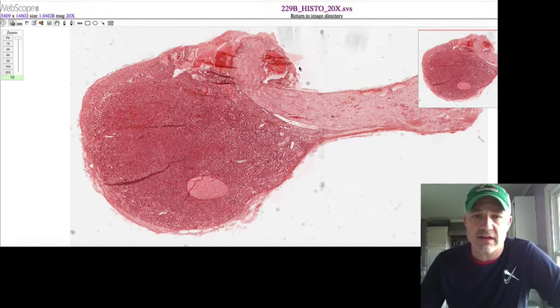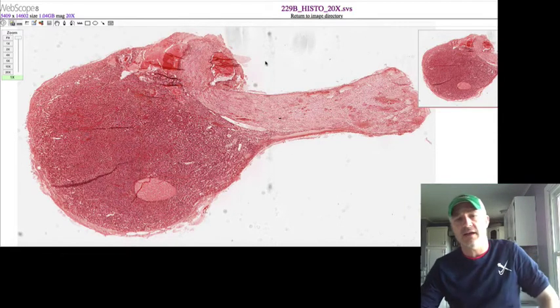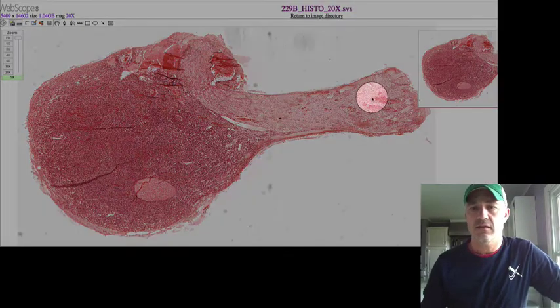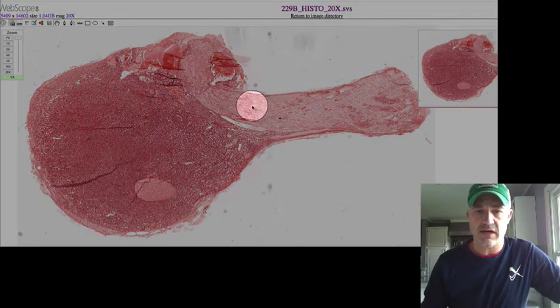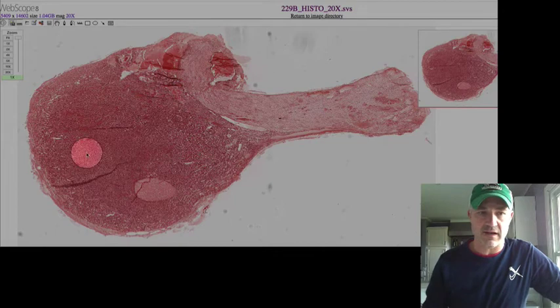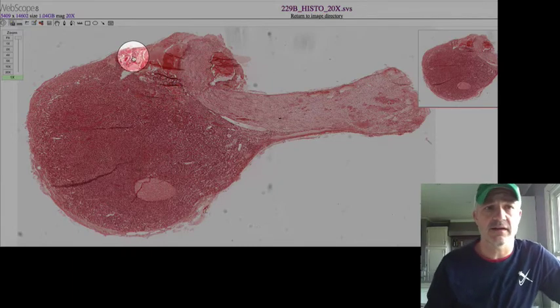The first one here is just kind of more of a zoomed out version of the pituitary. It's at 20x. It doesn't show you a good posterior pituitary on this one, but you can see the infundibular stalk coming down right here. Part of that pars tuberalis wrapping up right there. You can see the pars distalis, or the anterior pituitary, right there. On this image, the posterior pituitary, if it was still there, would be about somewhere back here. And you can see the middle pituitary, or the pars intermedia, through that section right there.